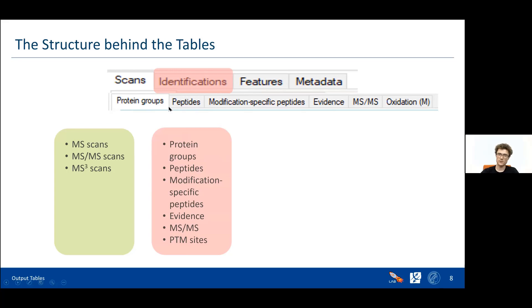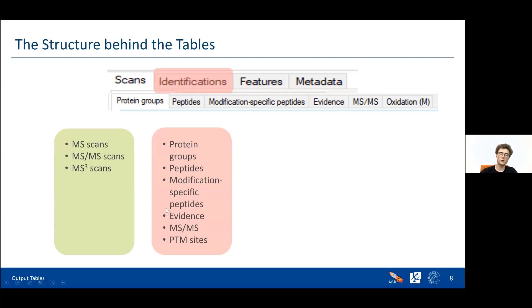Within the identifications class, you get the peptides — which the identification of proteins is based on. Some of them might be modified. Then you have information about modification sites, for example oxidation. Then more specific information about the second MS scan. And then information about the evidence — which tells you which peaks in the data actually caused the identification of a peptide, which then caused the assumption that a certain protein might be in your data.